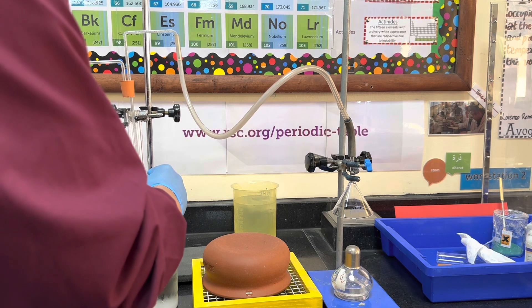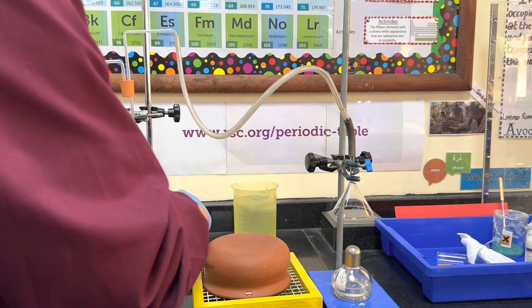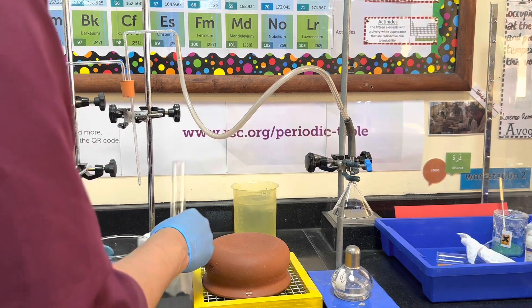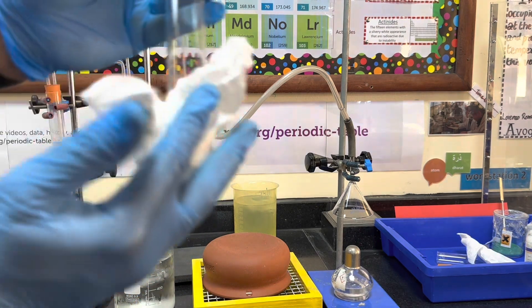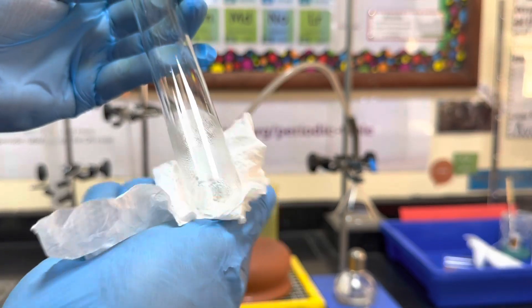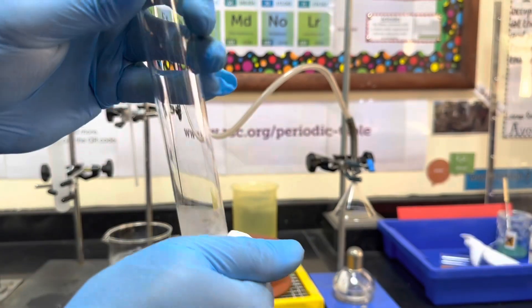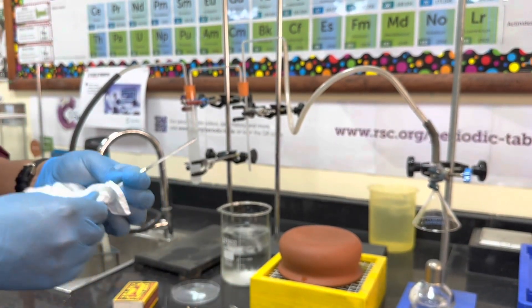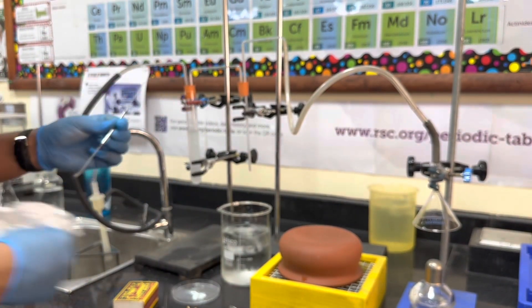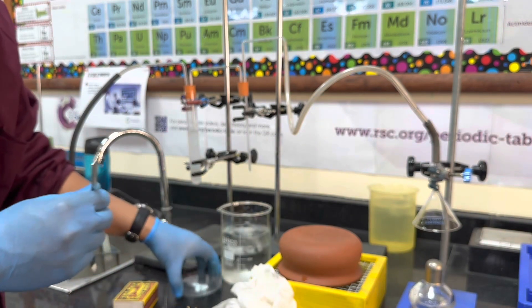We will then use the anhydrous copper(II) sulfate to confirm the presence of water. The anhydrous copper(II) sulfate will turn from white to blue. So here you can see that there's condensation on the inside.